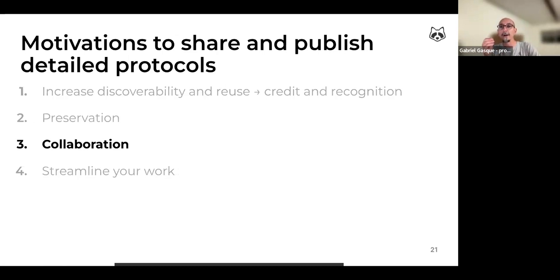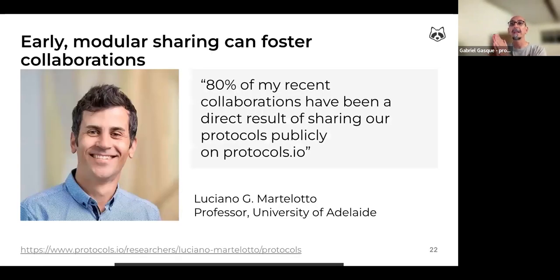And public sharing of protocols also increases the chances of establishing collaborations, as we have seen cases where researchers report that this is the case. And I would like now to show you how the comment functionality of the platform allows an open, scholarly, and productive discussion between all parties interested in a particular protocol or method.